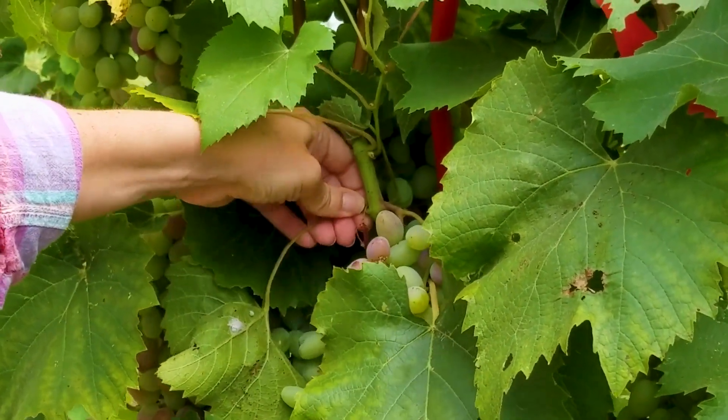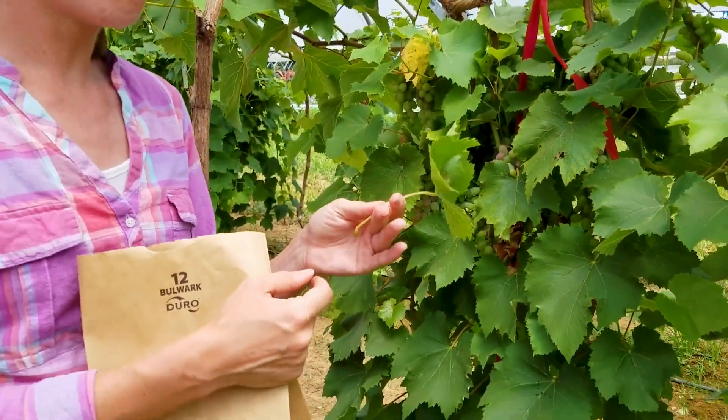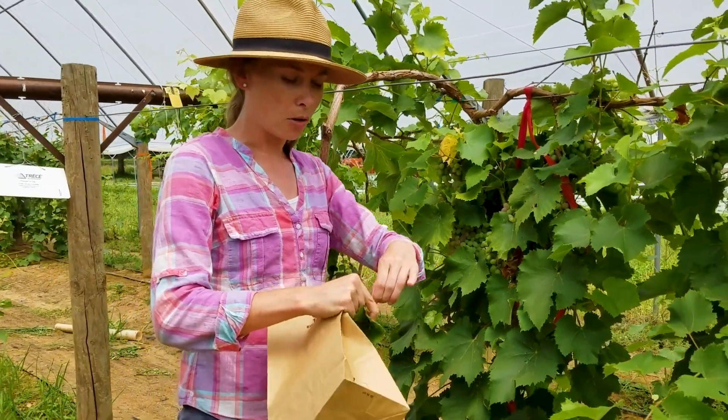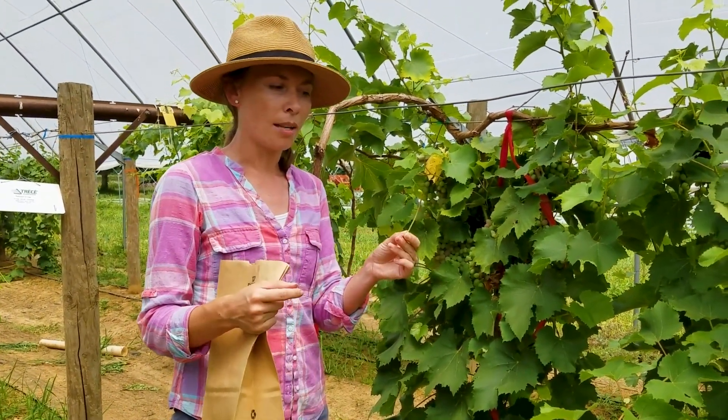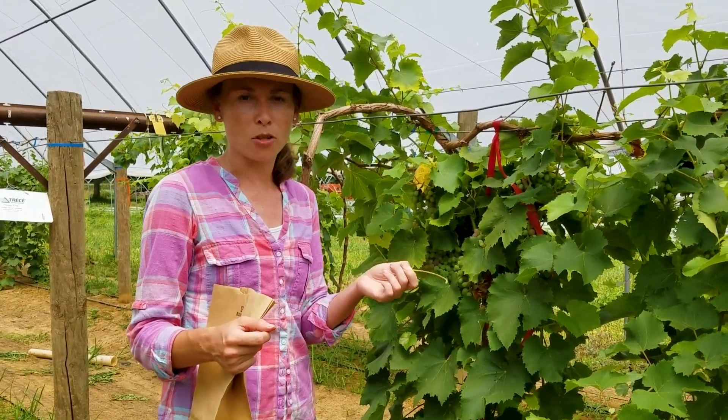So you're just going to come in, snap the petiole right off the main stem, and then immediately separate the leaf from the petiole. You're going to submit about 50 petioles from a given variety that's managed the same way.